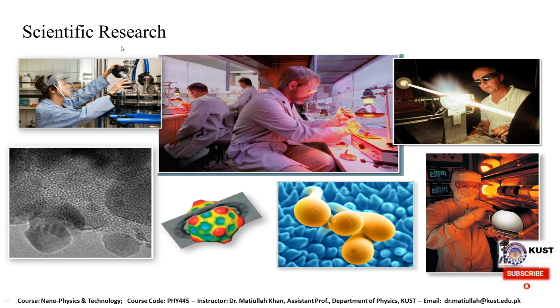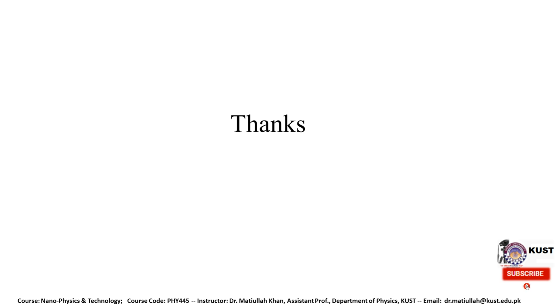Normally in labs, electron microscopes are used to know the structure, phase, composition, lattice parameters, and crystallinity of the samples, and these are some of the basic information we need to know about materials. Changing the structure can change the property, and we can get information about the structure of the sample from this TEM. So this is something about today's lecture.